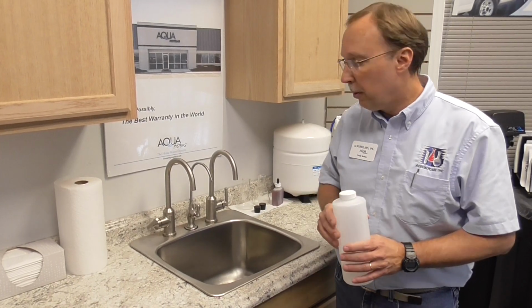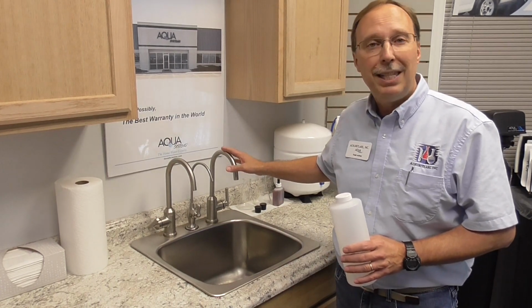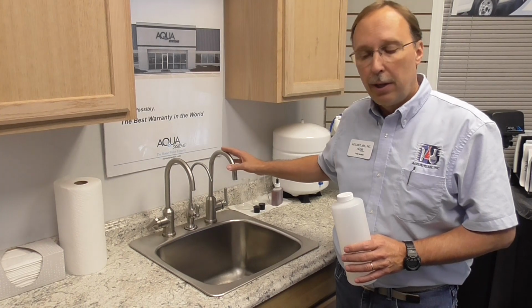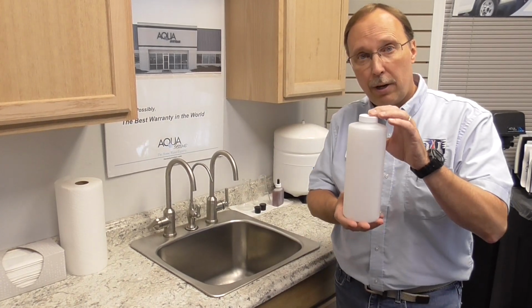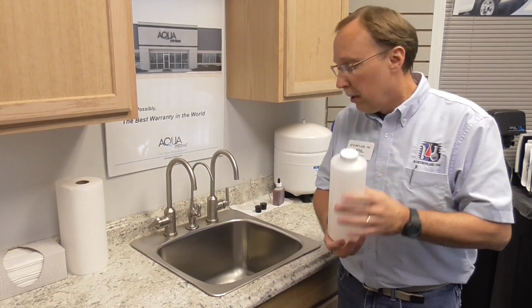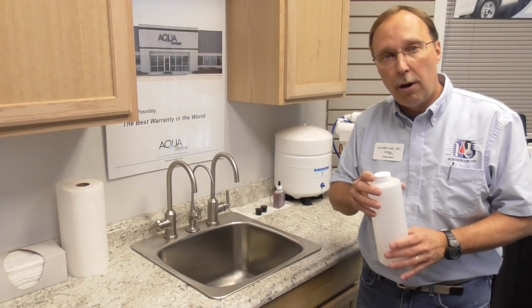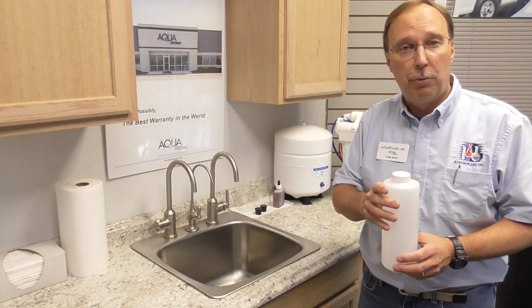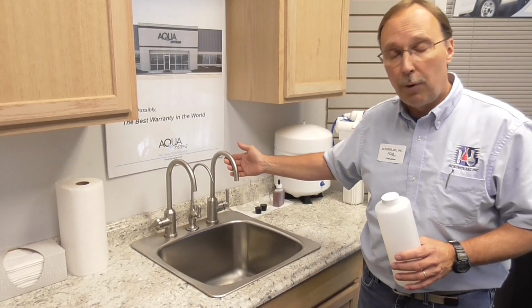The first thing you want to do is make sure that the water has been stagnant for at least 6 hours prior to sampling. We also want to collect a quart or liter of water at a time. We call this a first draw, meaning first thing in the morning, like first thing when you get up, this spigot's been stagnant for 6 hours overnight.